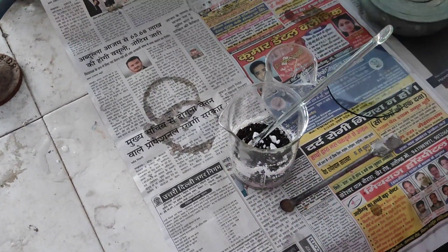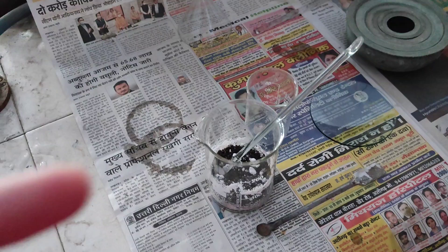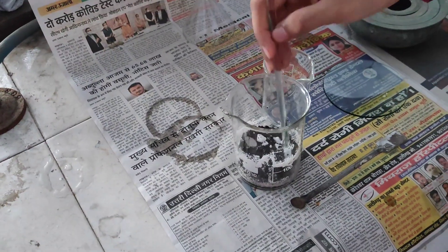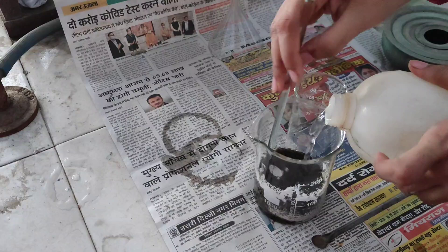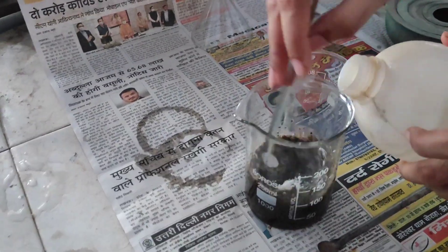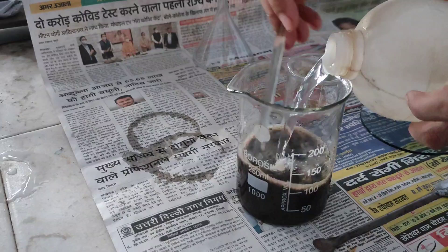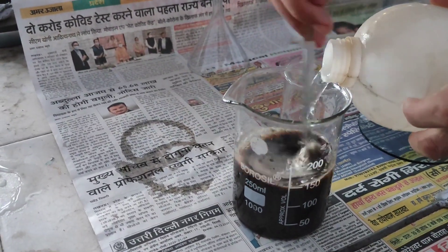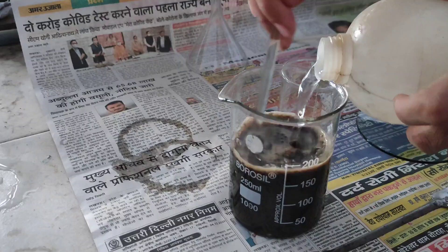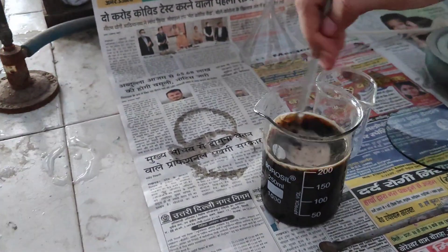Mix both very well. After mixing the tea with the sodium carbonate, add distilled water. We add 200 ml of distilled water into the beaker and mix it well.